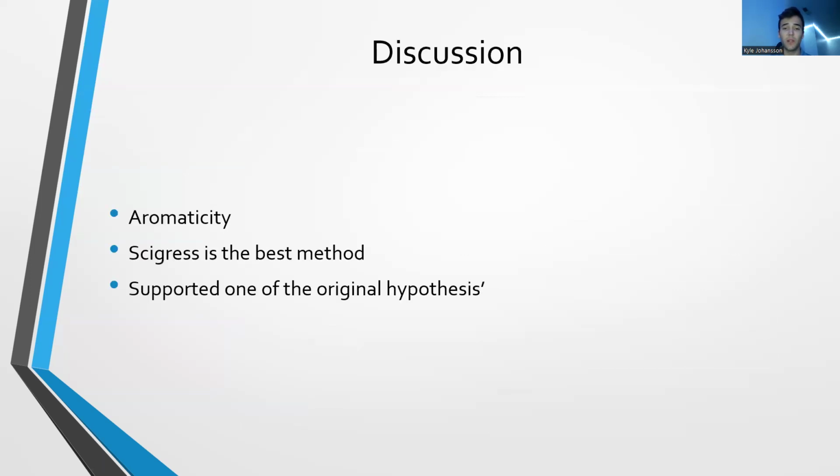Using this data, many conclusions can be made. One of the most prominent is the stability of benzene and the amount of energy that is needed to change it into a different compound. A large factor of this is its conjugation. However, it can still be seen that it is much more stable than other compounds that also have strong conjugation. This is primarily because benzene is so aromatic, which is a way that it differs from the other compounds that it is often compared to.